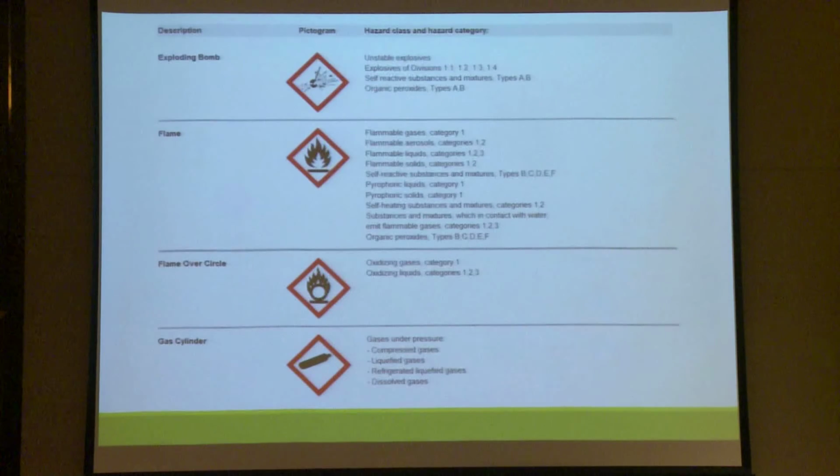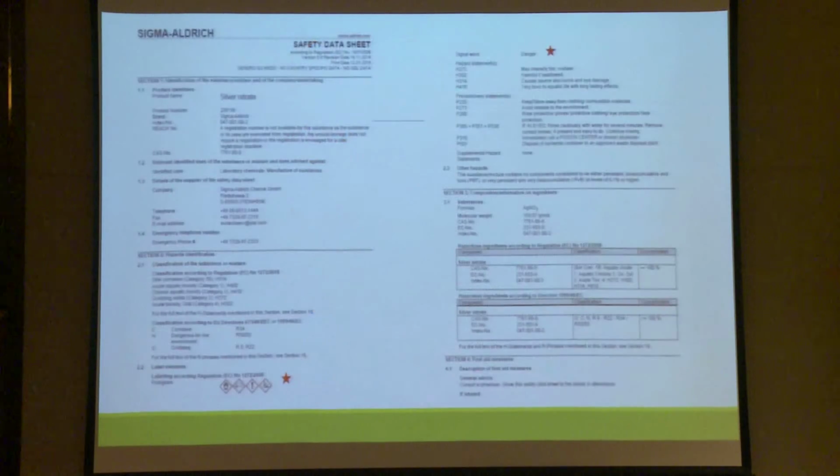This is a pictogram I told you about. I'm sure you know it. Everything has pictograms on it, with the reagents. And this is the safety data sheet for silver nitrate.